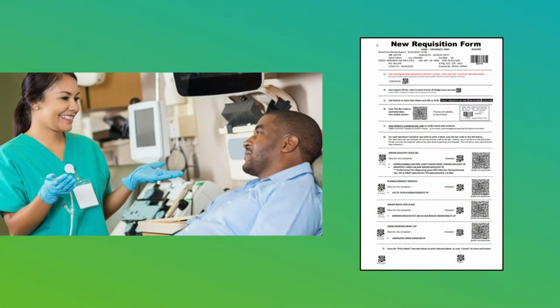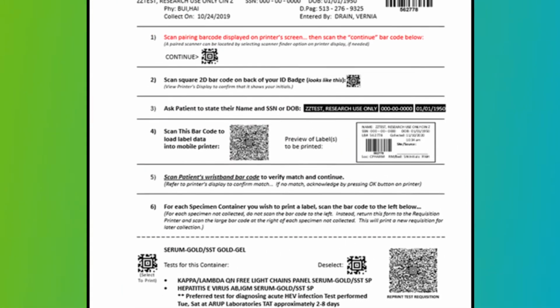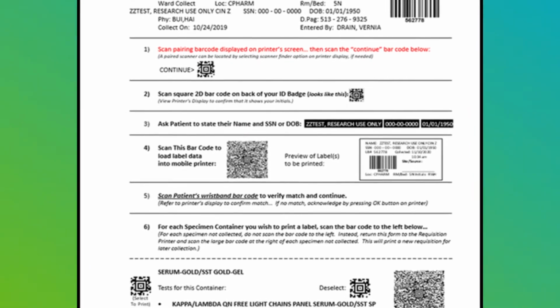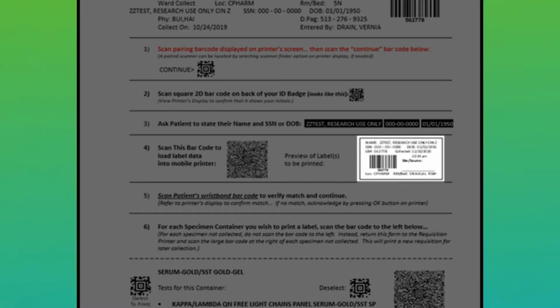This one hard copy requisition contains all the information for multiple specimen orders and a simple step-by-step guide for the workflow to be performed at the bedside. Notice in the center of this new form a large 2D barcode. This 2D barcode contains all the data needed to print the specimen label, and a facsimile of that label is shown to the right of that 2D barcode. It shows what the specimen label will look like when printed at the patient's bedside. We will take a closer look at the specimen label format in a moment.